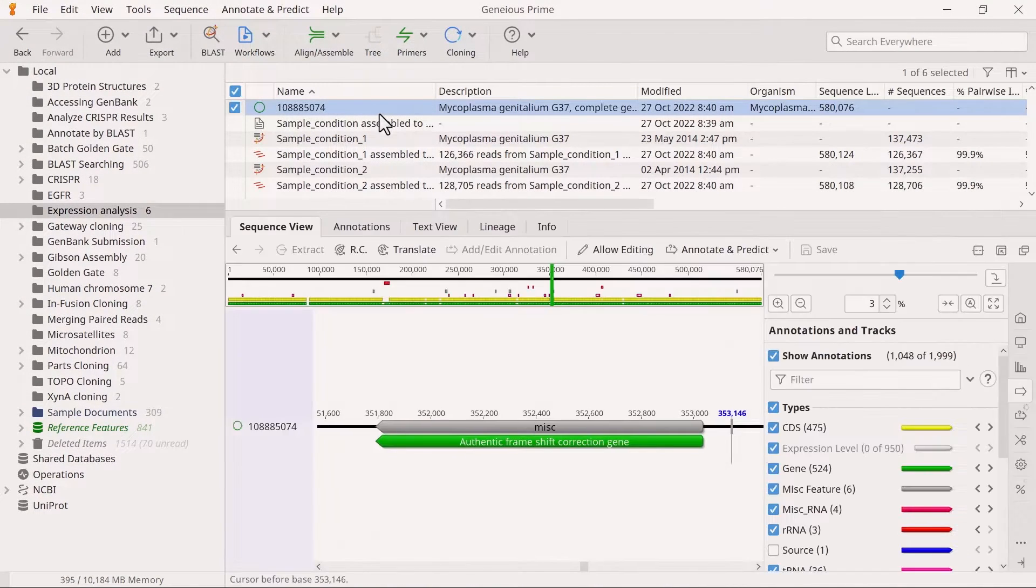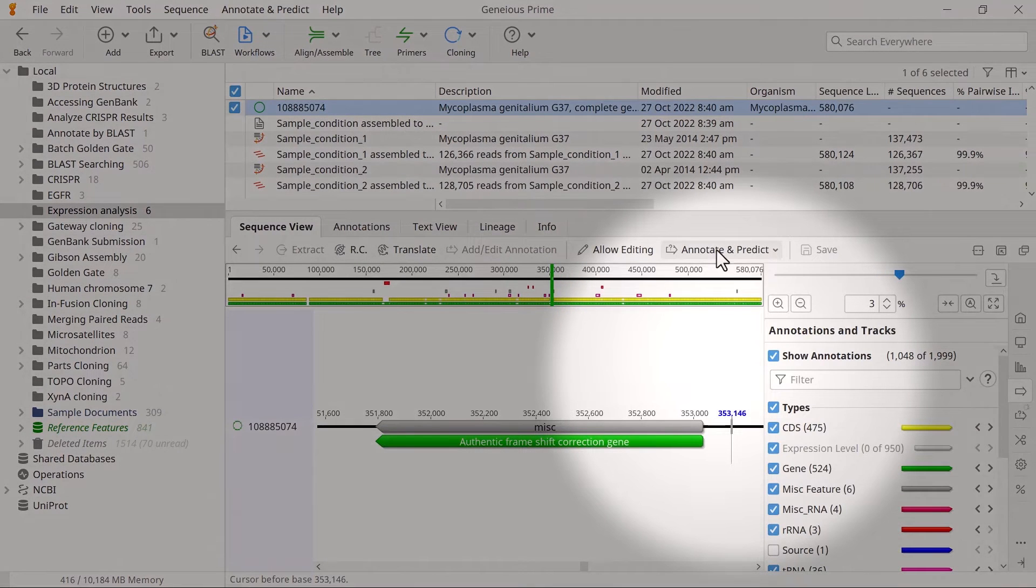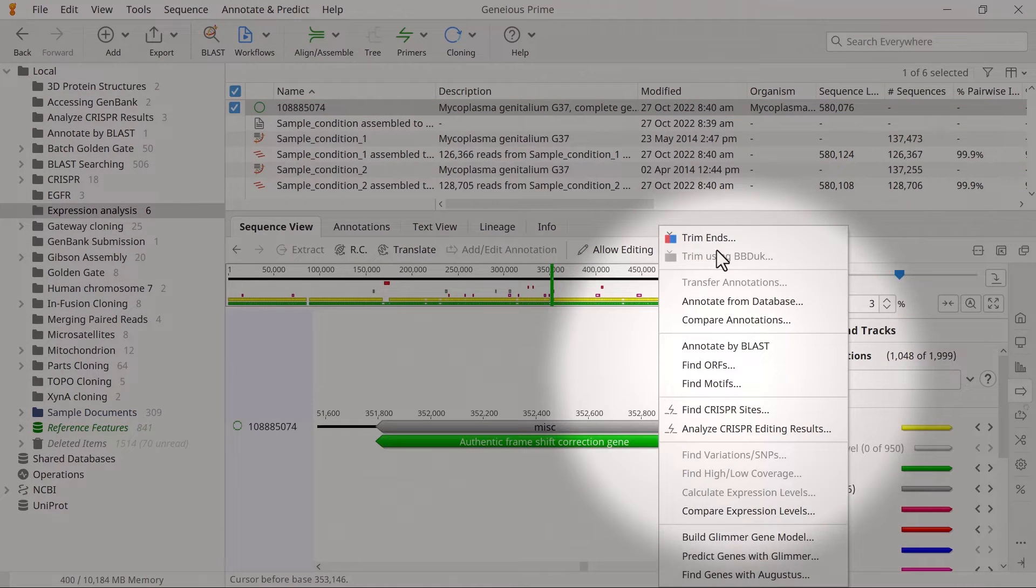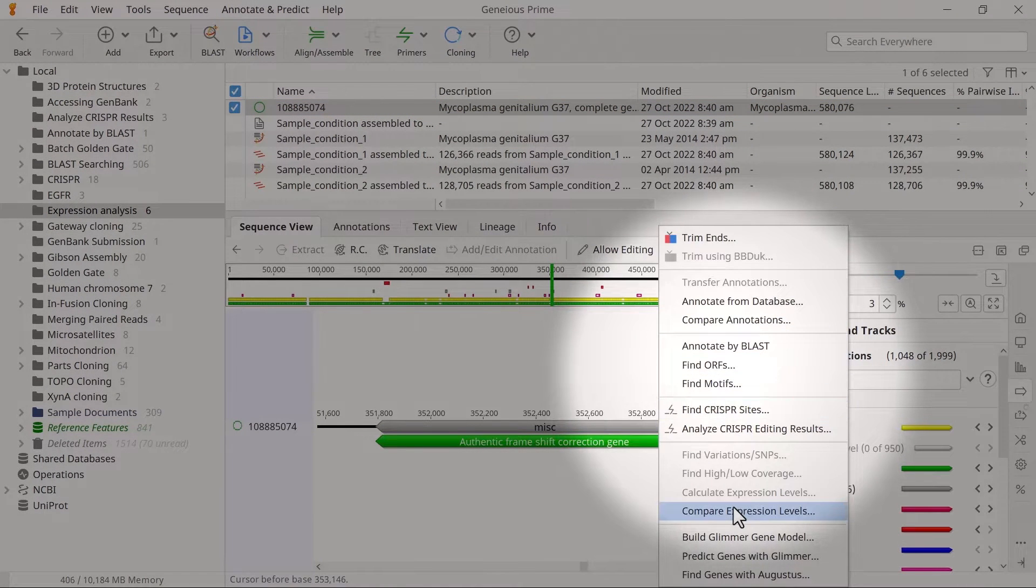go to Annotate and Predict and Compare Expression Levels.